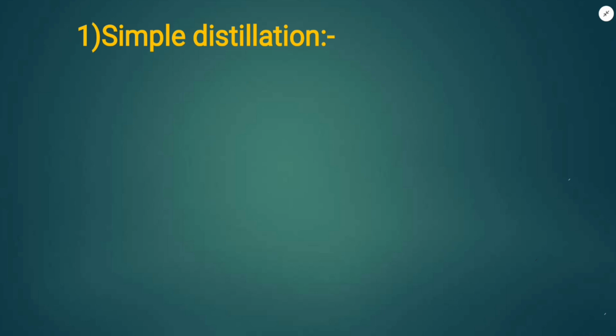In the previous session we learned about distillation, and the types of distillation are completed. Now in this session we are going to discuss simple distillation. Let's start our session.